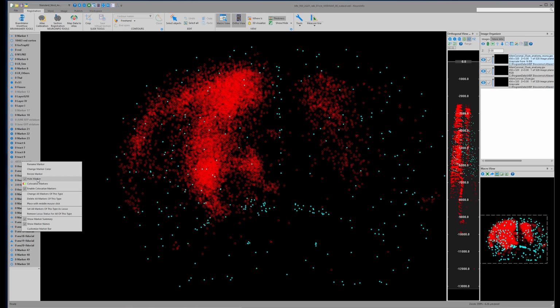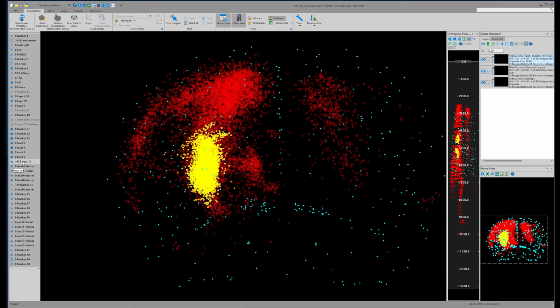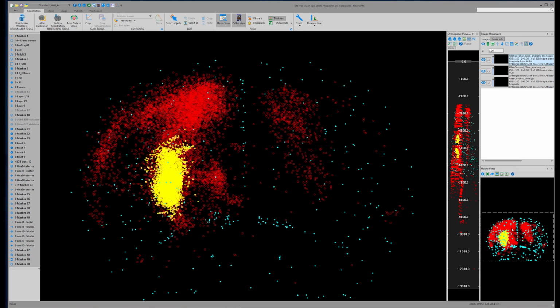And Chip, you can actually see in those red markers in the orthogonal view that angle throughout the extent of the brain, from the front to the back, in where those planes were projected via that offset that you found.